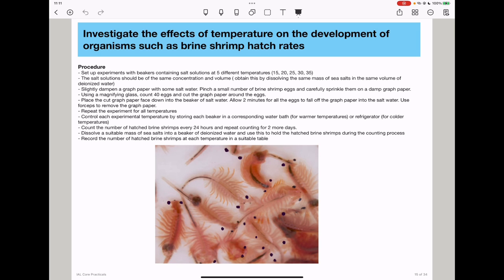Then, we will slightly dampen the graph paper with some salt water and pinch a small number of brine shrimp eggs, carefully sprinkling them on the damp graph paper. We will use a magnifying glass to count about 40 eggs, cut the graph paper around the eggs, and then place the cut graph paper facing down in the beaker of salt water. We allow the experiment a specific amount of time for the eggs to fall off the graph paper into the salt water.